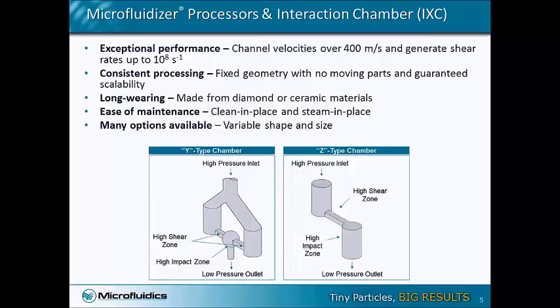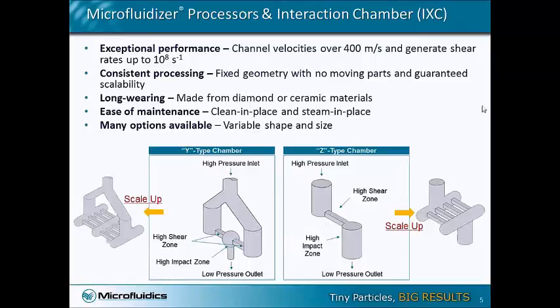We also have different types of shapes and sizes for the microchannels, which give you a variety of shear rate selections. Like I said, how we scale up is we actually add more identical microchannels in a parallel fashion.